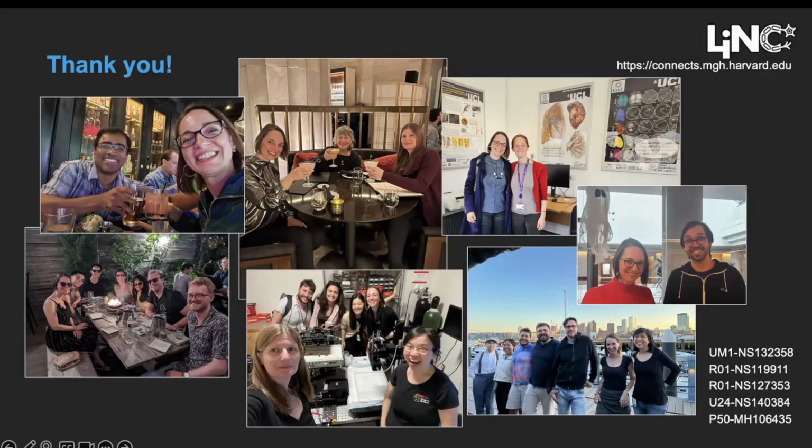And that's not the highest resolution. That's the one that's about 6-micron resolution. So the light sheet microscopy ones that go down to sub-micron scale are obviously even bigger. And so a big question that comes out of that is, do we need to go down to the highest scale everywhere in the brain?